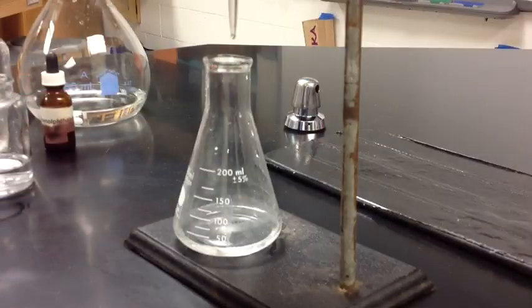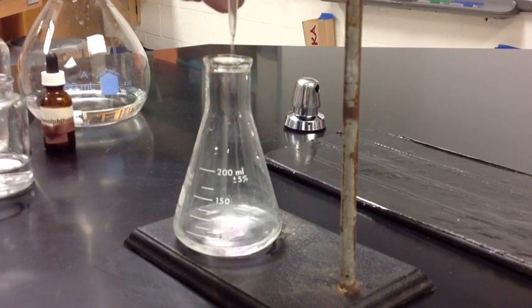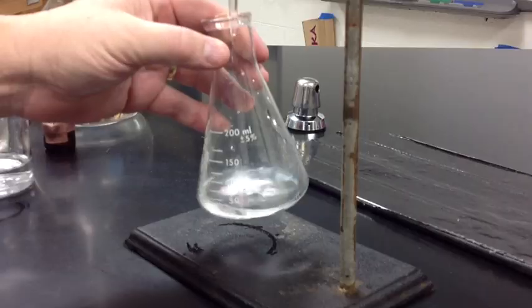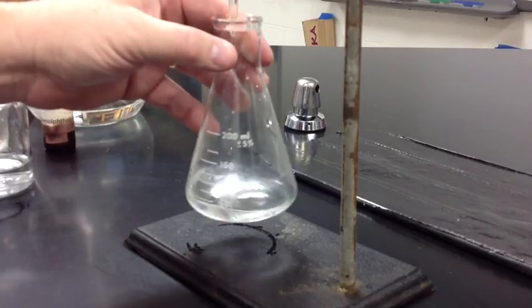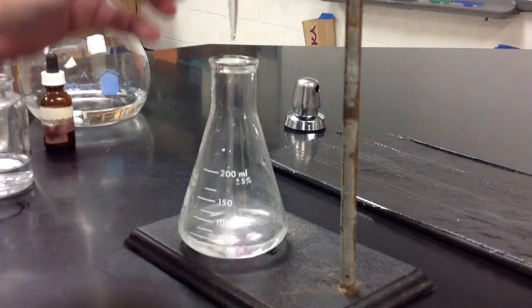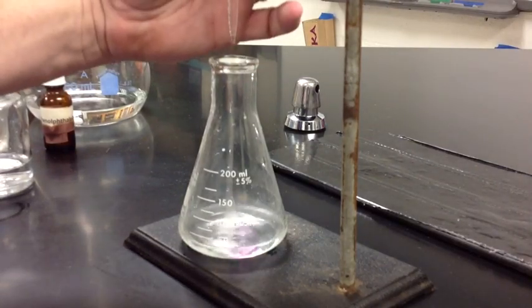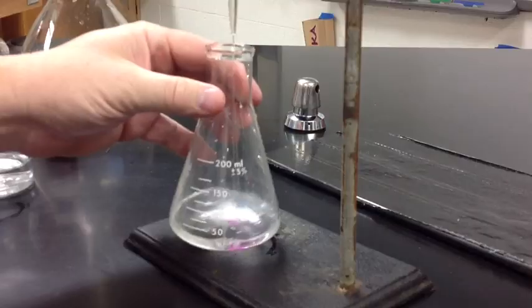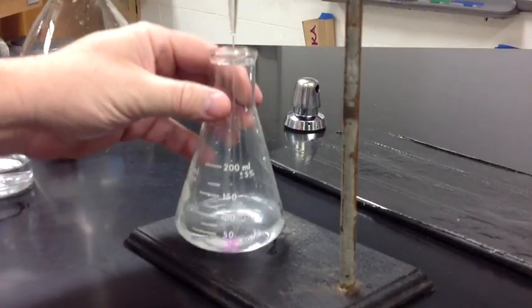Now we will begin the titration process by adding some sodium hydroxide to our acid solution. You will notice that we are going to start seeing pink, and as we swirl it, the pink will disappear. So we will add it at a little faster rate — see the pink forming? We swirl it and notice the pink goes away.